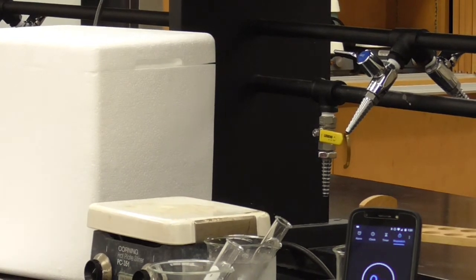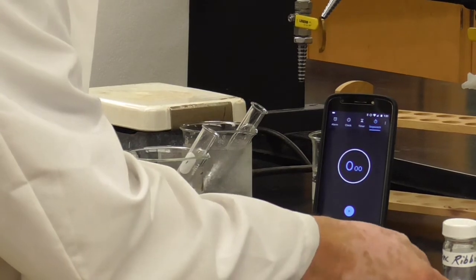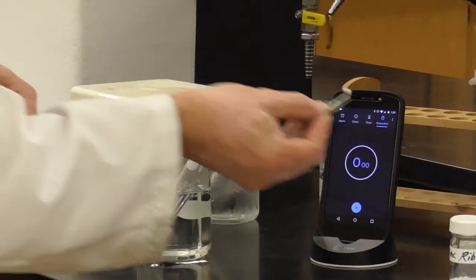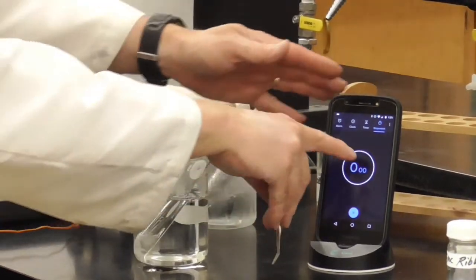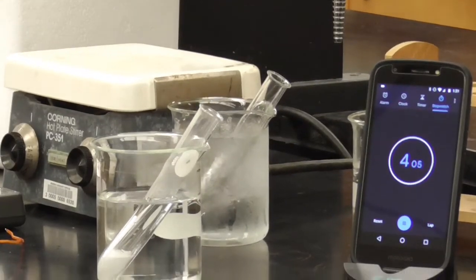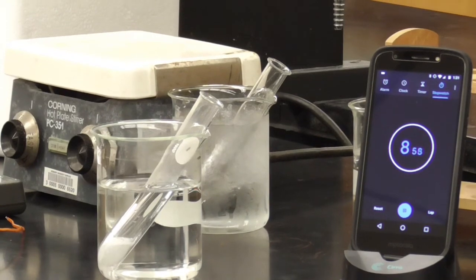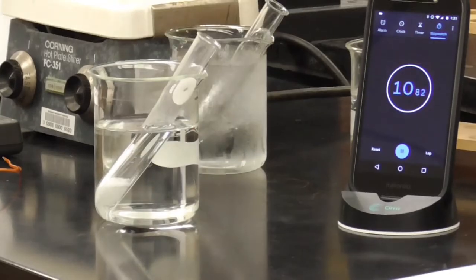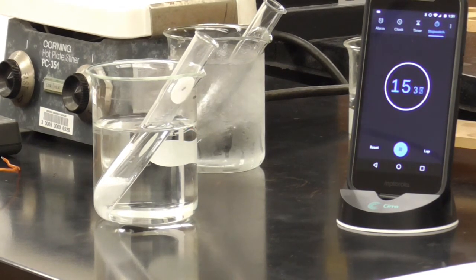Okay. We'll take our zinc, drop it in, and then we'll start the timer. Okay. And you can see just how vigorously the bubbles are coming up. This is definitely a faster reaction when we do it at the hotter temperature.